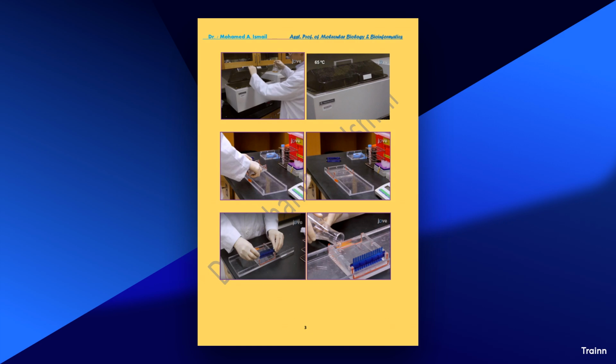7. Common troubleshooting issues. No bands. Possible reasons include failed PCR, incorrect annealing temperature, or degraded DNA. Smearing indicates overloading of samples, degraded DNA, or suboptimal gel concentration. Multiple bands suggests nonspecific amplification or primer-dimer artifacts.